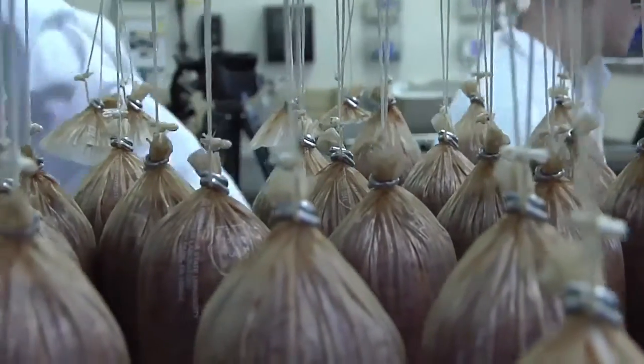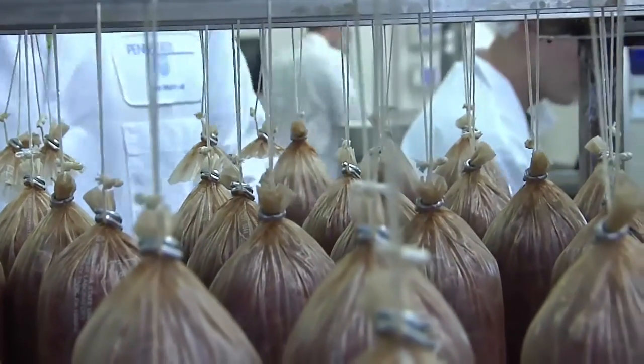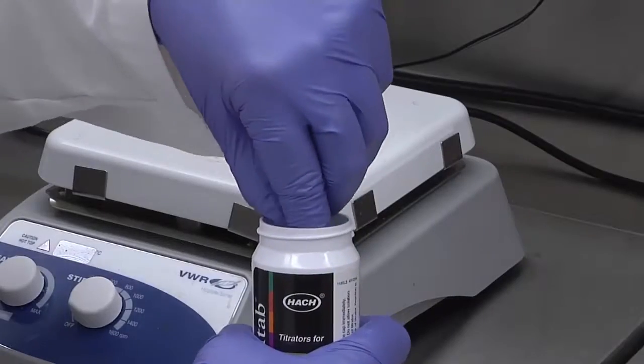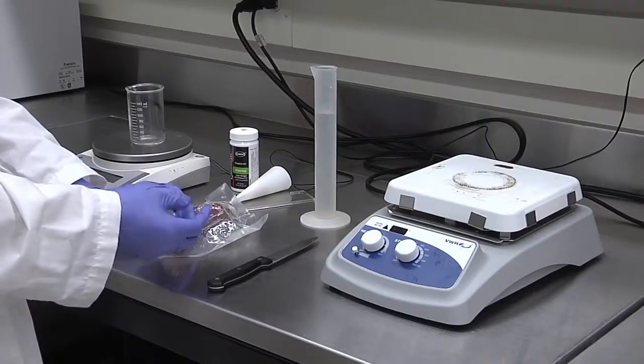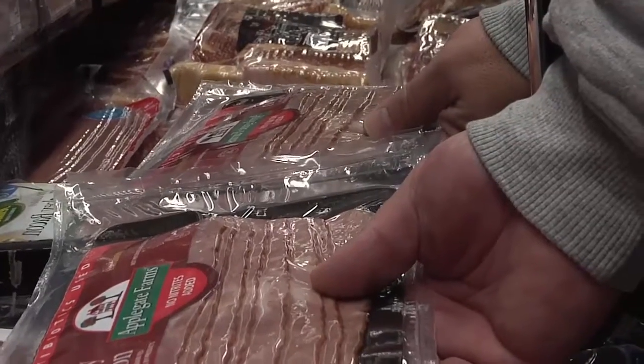It is critical when manufacturing products that you have an accurate yet rapid way to evaluate the consistency of these functional ingredients, especially in reduced sodium formulations.